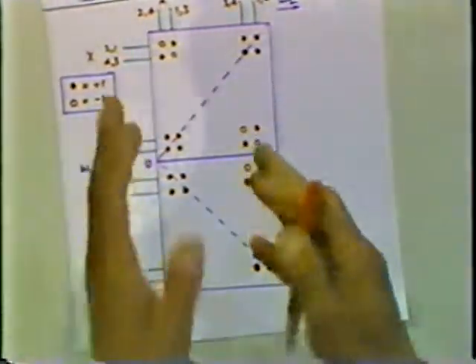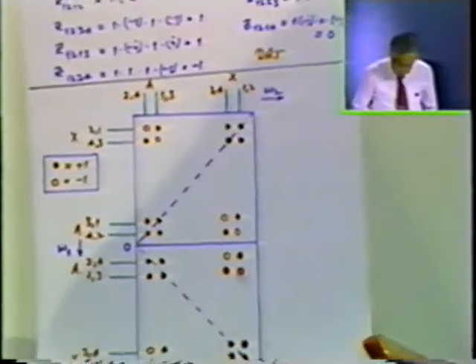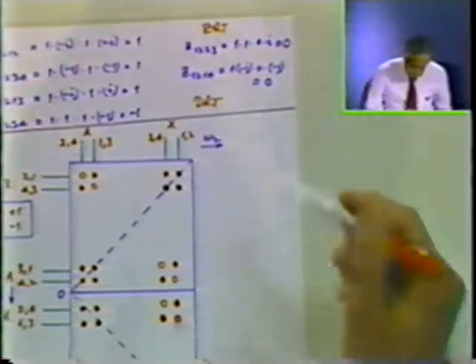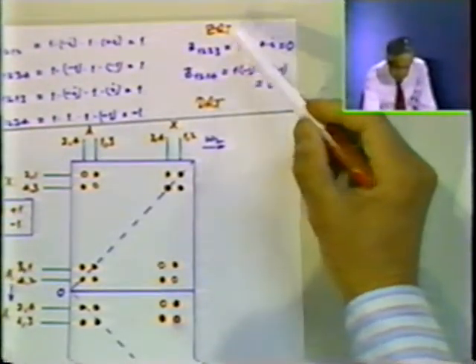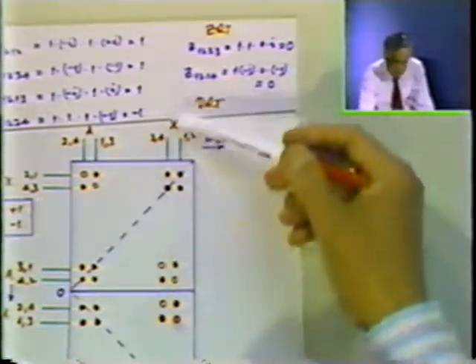So the correction that I had made in my transparency was correct, and what is given in the notes has to be corrected. This just says that the zero quantum transition and the double quantum transition will not show up in this case.